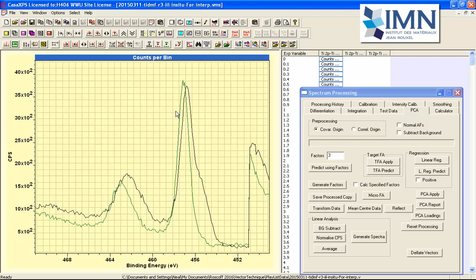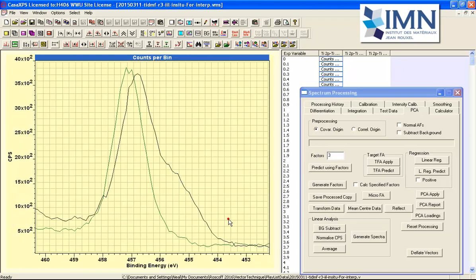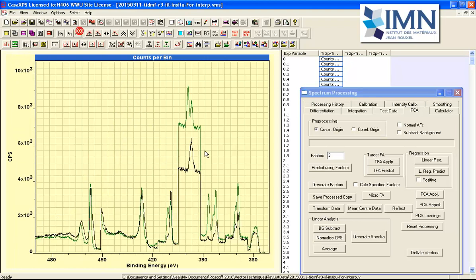So from these different spectra, there's an indication that you have at least one form that might be a 4+ state for titanium, and there's another form that looks like some type of combination of a 3+ and some 4+ like feature within the spectra. And this would be difficult to see from the original data, and by doing the difference data we can separate this type of information.